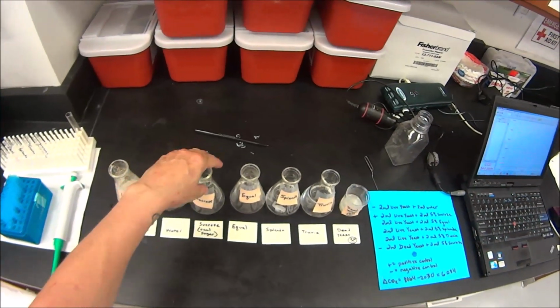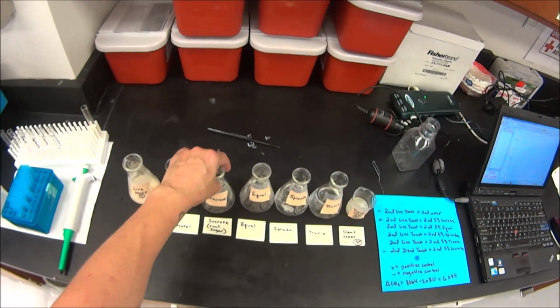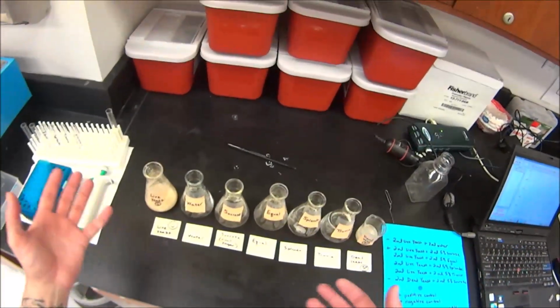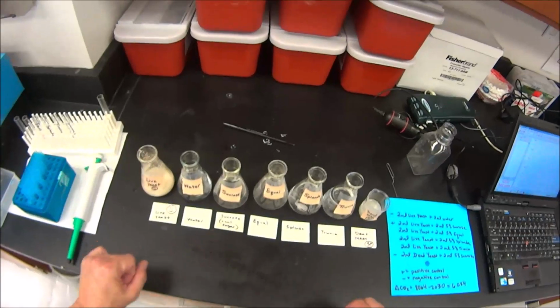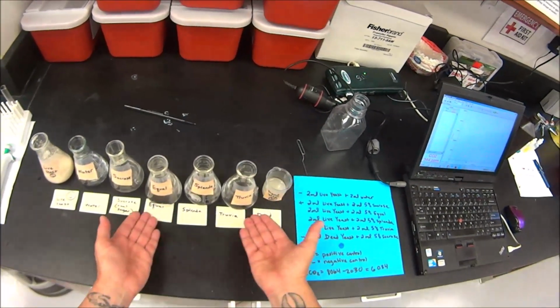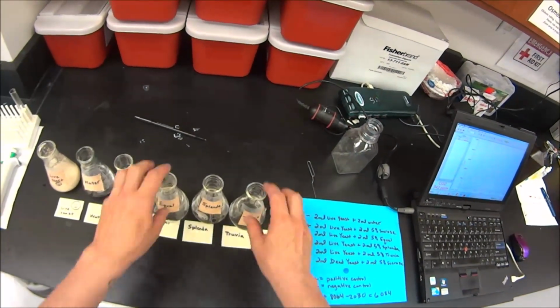So we've got sucrose, which we know yeast can metabolize because we have a wonderful beer and wine industry that uses mixing live yeast with sugars to make alcohol. But will yeast recognize artificial sweeteners? We're going to find out.